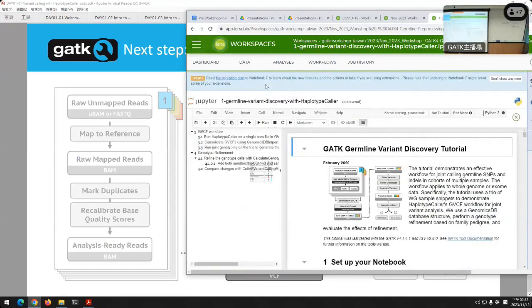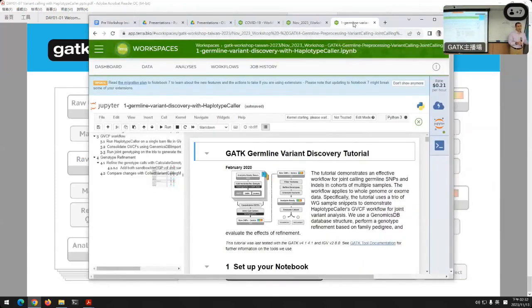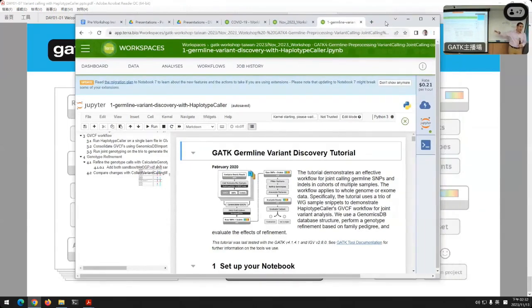Thank you very much. That was a great question. I forgot to mention this on one of my slides. There is a mode to output the haplotypes. It's called -bamout. We talked about the flags: -R is for the reference, -I is the input. There's also -bamout, and that will let you output the alignments.